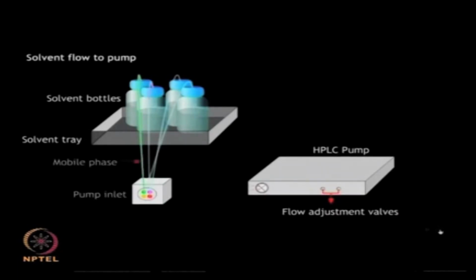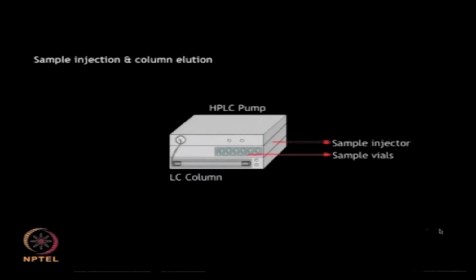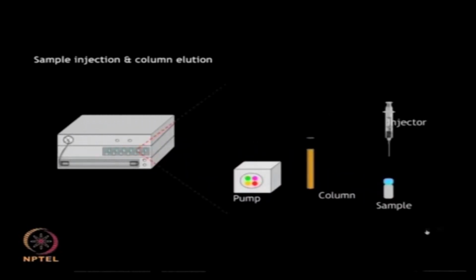Different solvents can be placed in the solvent bottles depending upon the purification requirements. These solvents are mixed in the desired ratio and pumped into the column during elution, after removal of any trapped air by means of the degasifier. The sample injector system may be automatic or manual.